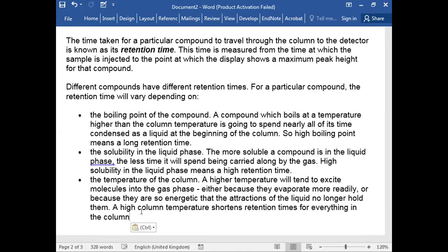तो आपके पैरामीटर नहीं थे, अब आप वेट कर रहे हैं, the graph is not showing anything, nothing is being detected. मुझे बड़ी डांट भी पड़ी शुरू में, क्योंकि I was an intern, बट सैंपल, क्योंकि कुछ सैंपल्स वाकई बहुत, they are very rare and you cannot get a lot of them. तो इसलिए ये आपके पास बड़ी काम की चीज़ होती है, लेकिन सैंपल इस्तेमाल थोड़ा सा होता है, very small amount of sample is required.